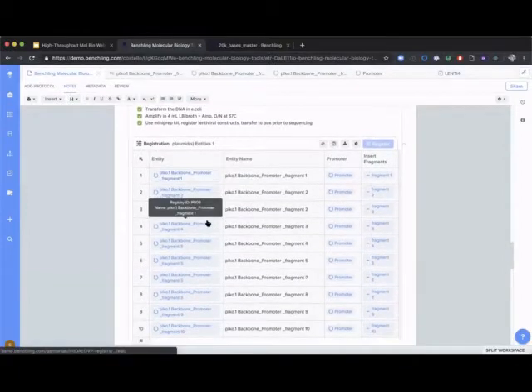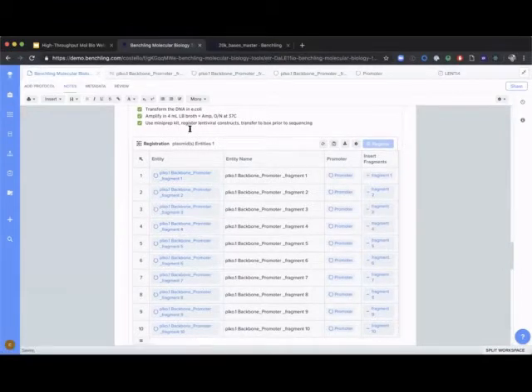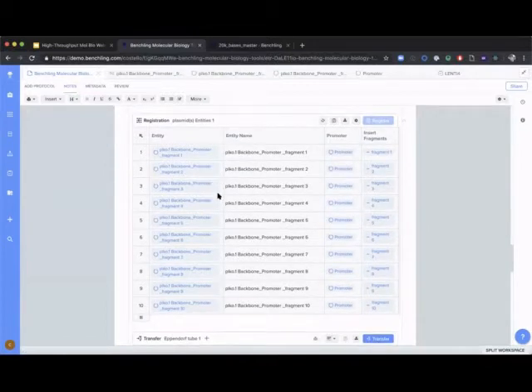In similar fashion, you could imagine me being a plasmid vector design scientist, I might want to register these plasmids now that I've gone to the bench. I've actually created them, and I've captured specific data against them. I might want to, again, leverage Benchling's registration system to capture and monitor these vectors down the line.